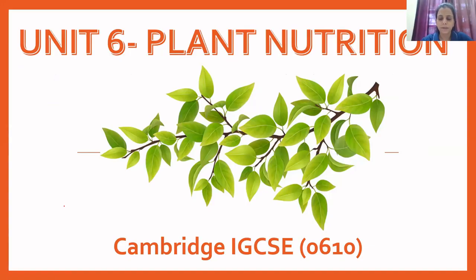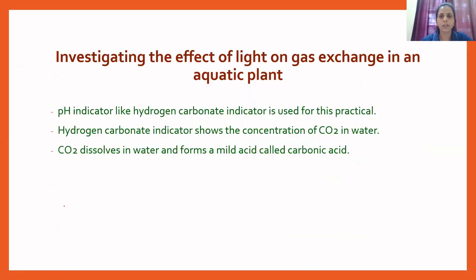Hello everyone. In this video, we are going to investigate the effect of light on gas exchange in an aquatic plant. In the previous video, we discussed the effect of light on gas exchange in normal plants. We have seen that during daytime, whenever light is present, plants perform photosynthesis as well as respiration.